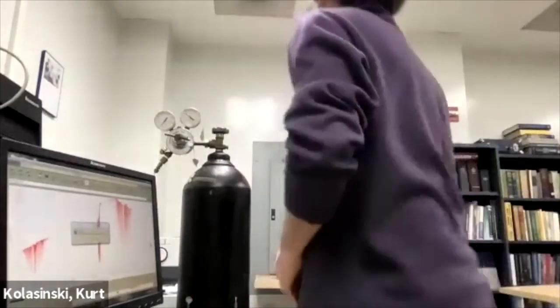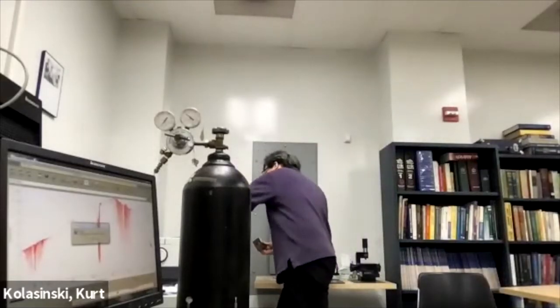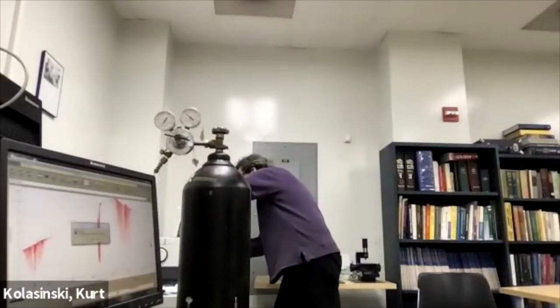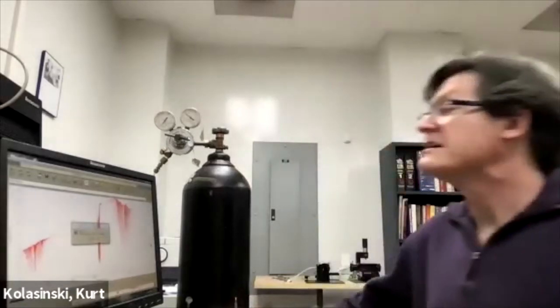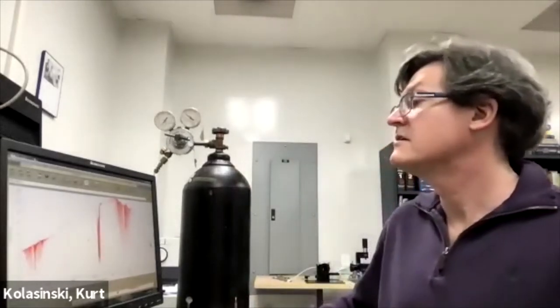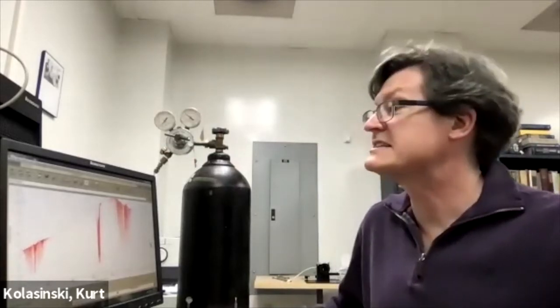All right. So I take our cell and slot it in there. Say OK, right? And it will start taking. Now, oh, wait a second. What is going on here? You see all kinds of red. It's bleeding all over the screen.